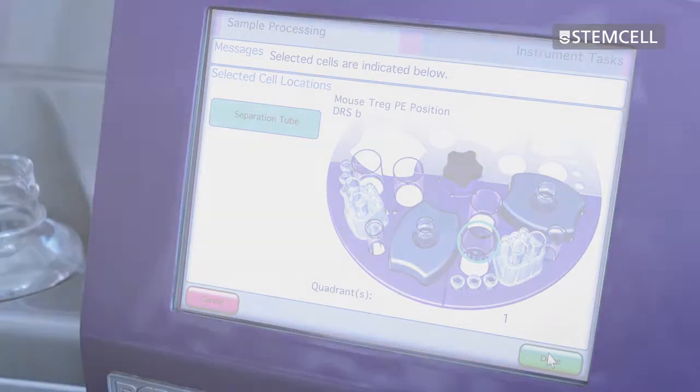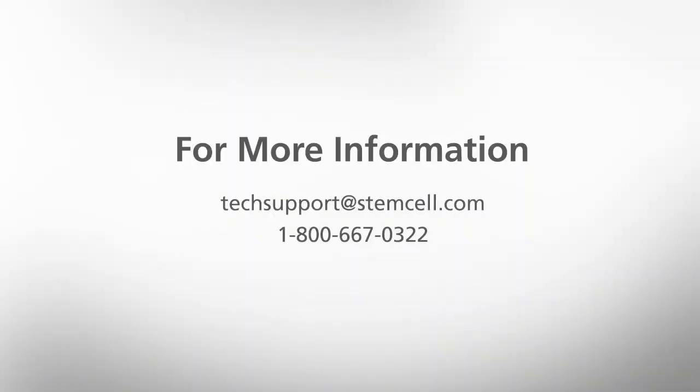Press done when finished. If you have any further questions, contact us at info@stemcell.com.